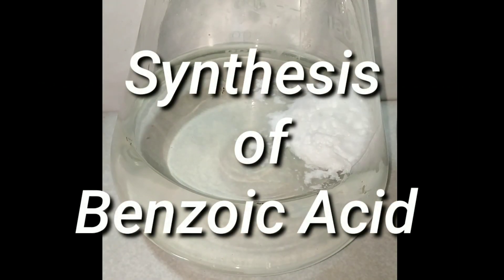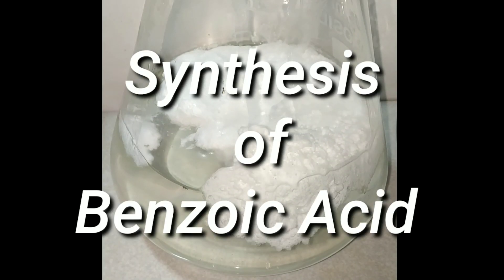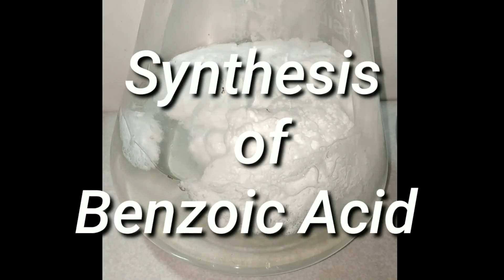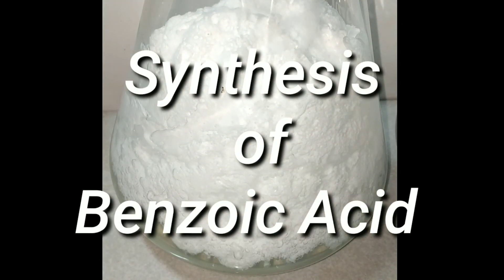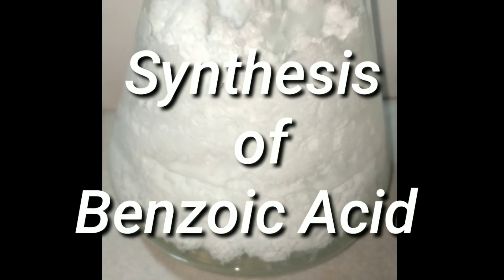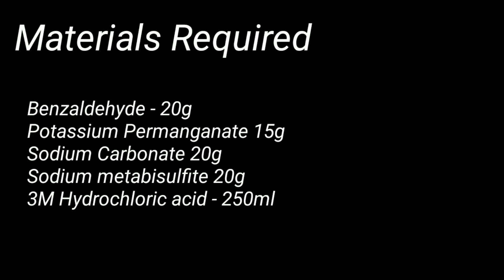Hello friends, in this video we will be oxidizing benzaldehyde to benzoic acid using potassium permanganate as the catalyst. This video is just for academic purposes only, as benzoic acid can be very efficiently synthesized from toluene, which is readily available. These are the materials required for this synthesis.